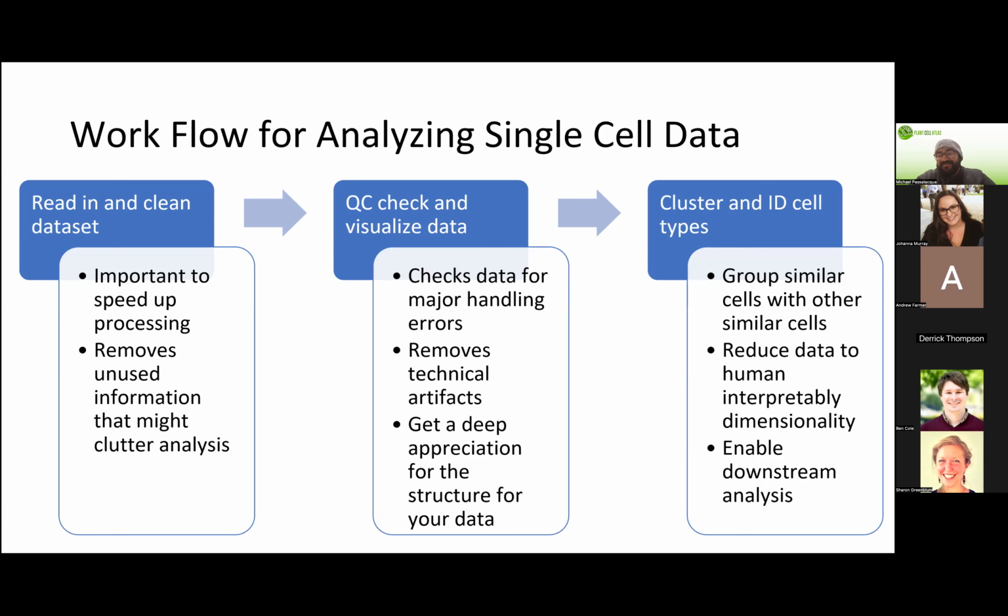It also makes a lot of downstream analysis easy. A big reason why we do this grouping of similar cells is that single cell data is very sparse. For any one cell, we're not capturing all of the mRNA in that cell. We're only capturing a fraction. I think for 10x, the capturing estimate is around 10 to 20% of the mRNAs.